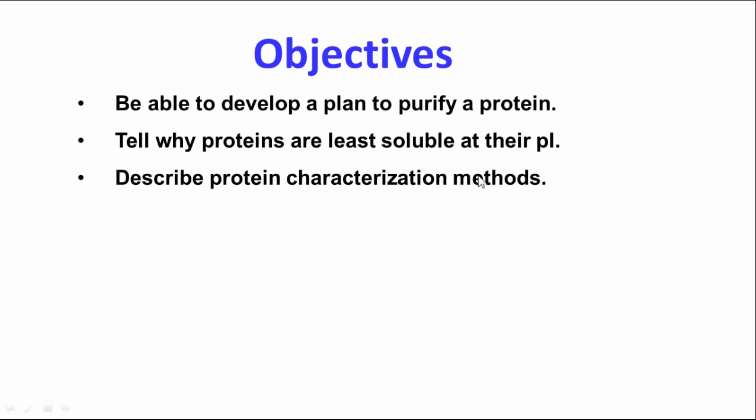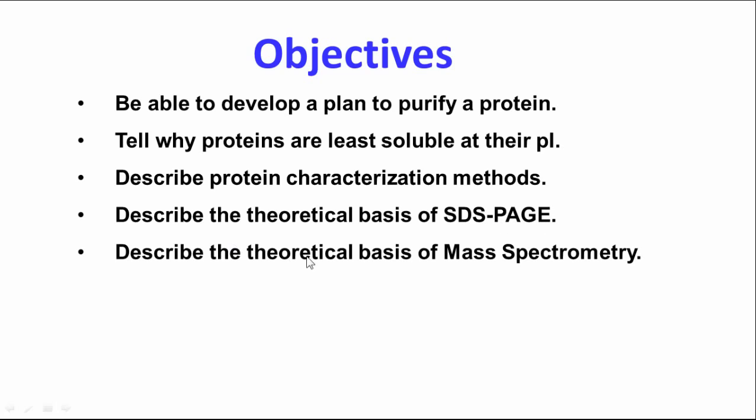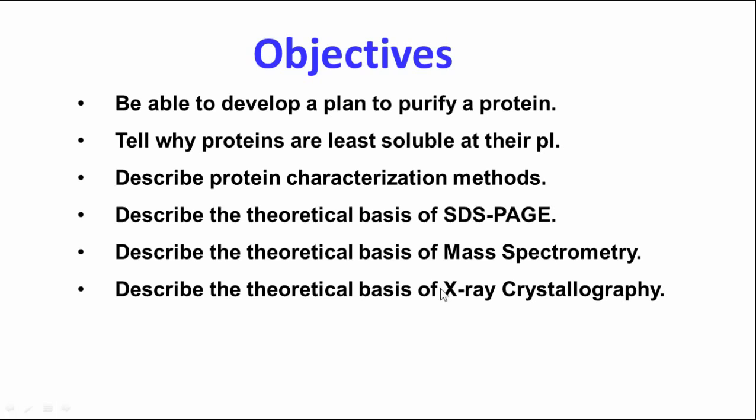describe protein characterization methods, describe the theoretical basis of SDS-PAGE, that's sodium dodecyl sulfate polyacrylamide gel electrophoresis. Describe the theoretical basis of mass spectrometry for proteins. Describe the theoretical basis of X-ray crystallography.